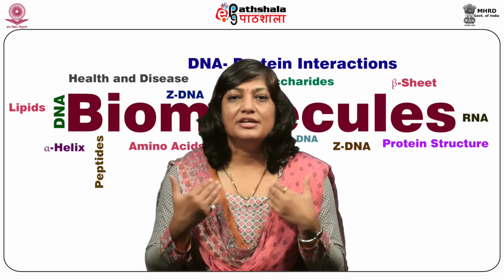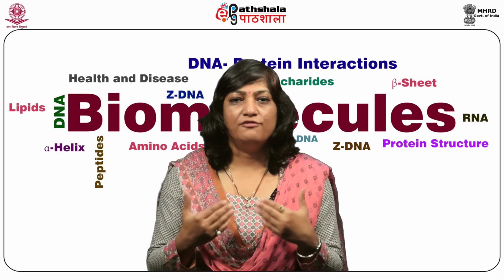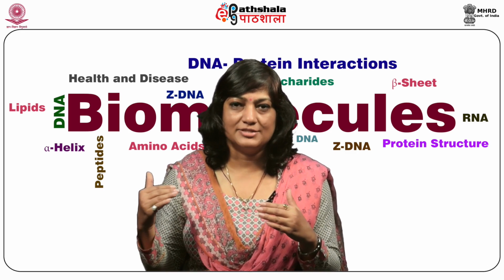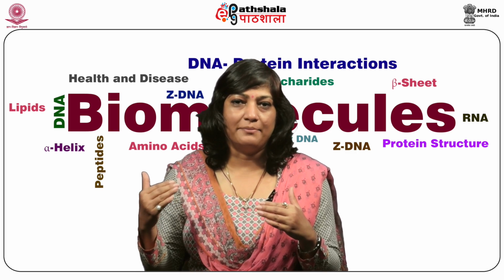GLC is generally coupled to mass spectrometry, making it a very powerful analytical technique because the samples that come out of GLC are directly subjected to mass spectrometry, where they are analyzed based on their unique fragmentation pattern.